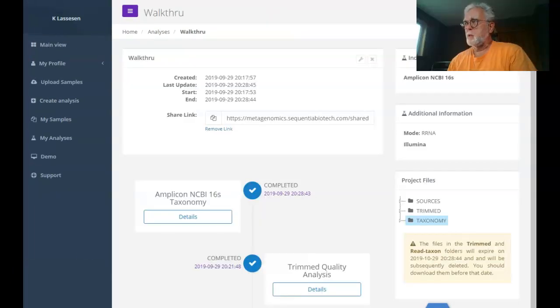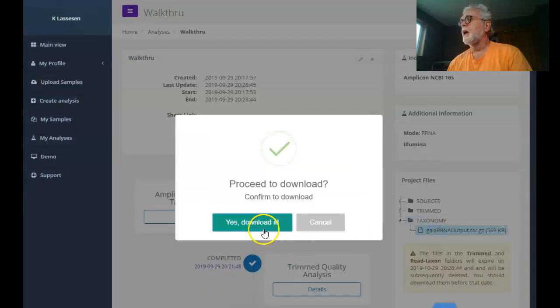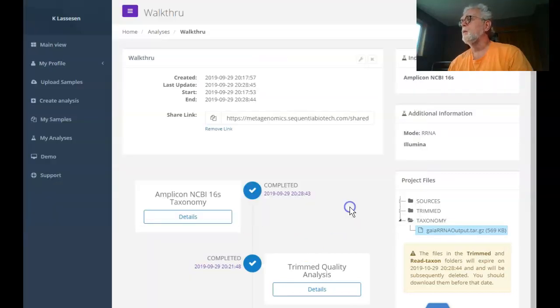The stuff is on screen, but you want to have a machine readable format. It's available. I need to show you the little trick of finding it. It's sitting over here in project file. We have three things. If you double click here, you'll see a file there, and you can basically just click that and ask it to download it, and we'll put it in the same folder.